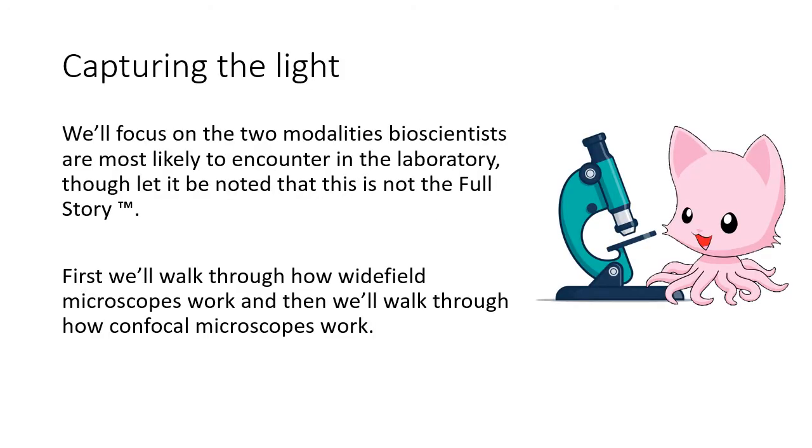Modalities. In this talk, we will focus on the two modalities bioscientists are most likely to encounter in the laboratory, but of course, there are many other kinds of microscopes as well. First, we will walk through how wide field microscopes work, and then we'll take a look at the confocal microscopes.